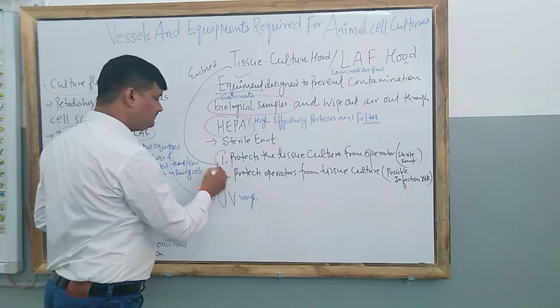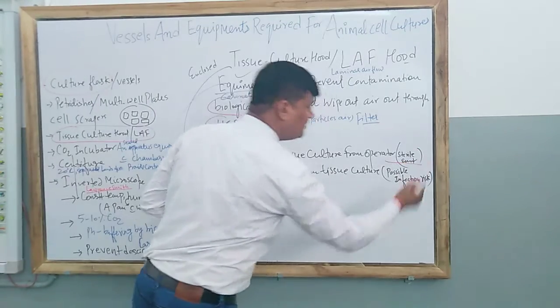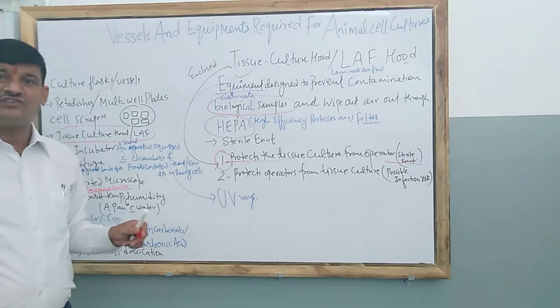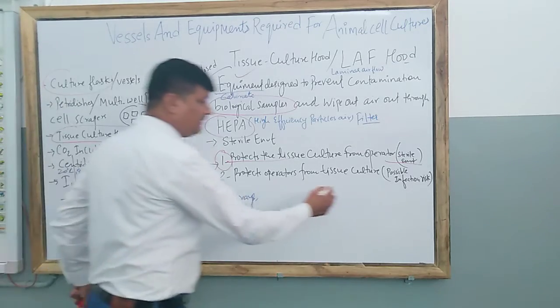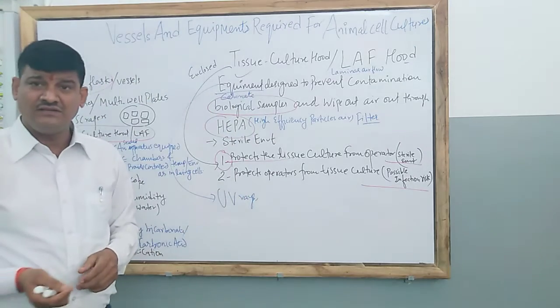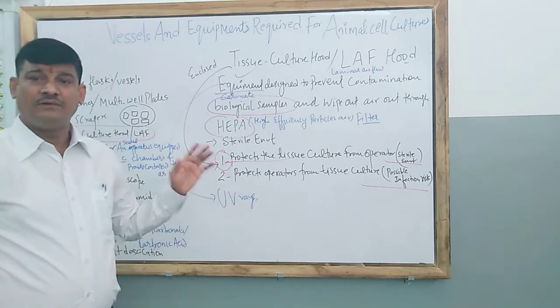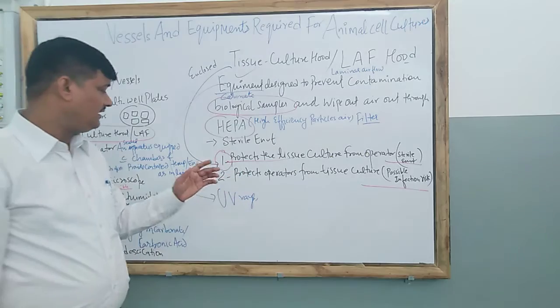So two basic functions are delivered by the tissue culture hood. Number one is a sterile environment; a constant sterile environment is established in the culture hood. The second is that it reduces the chance of infection to the person who is working on tissue culture or culturing of the animal cells.